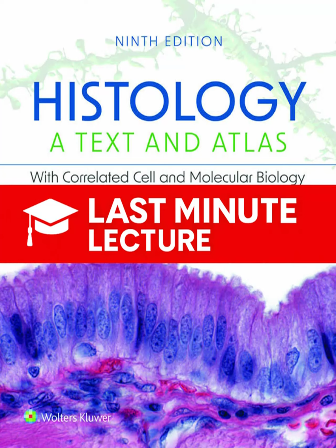So when we see that blue or purple staining from a basic dye, we know we're looking at something rich in genetic material like the nucleus, or something with a lot of synthetic machinery like the rough ER. That's right. The rough ER, which was historically called ergastoplasm, is heavily stained because it's packed with ribosomal RNA. And that RNA provides a super high density of anionic phosphate groups for the basic dye to grab onto.